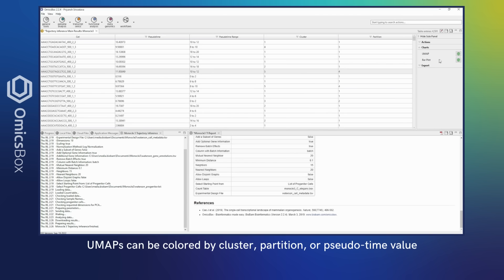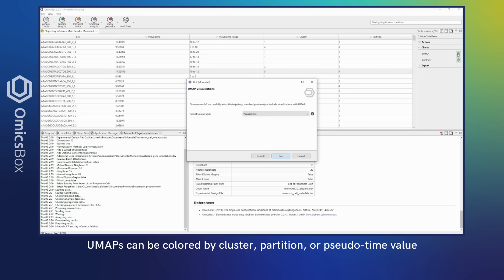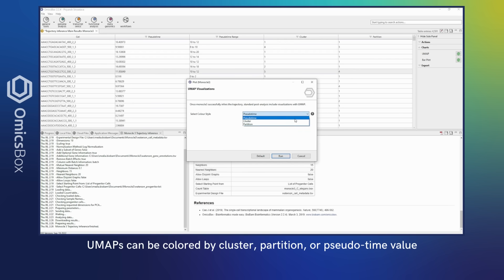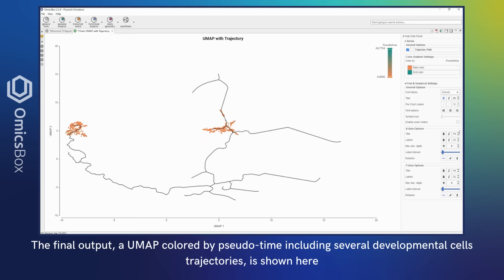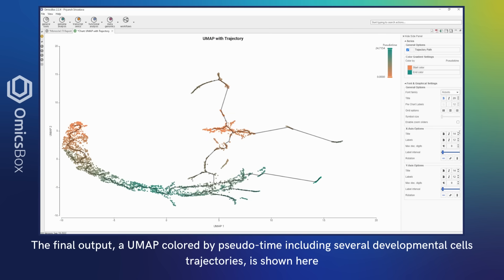UMAPs can be colored by cluster, partition, or pseudotime value. The final output, a UMAP colored by pseudotime including several developmental cell trajectories, is shown here.